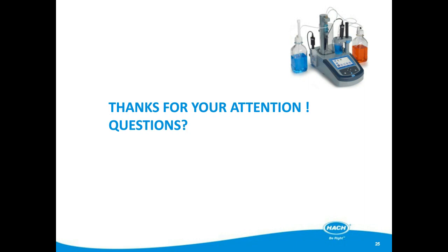Okay, I think that is clear. A final question, and I think it is the last one. I can't see other ones, but if you have one, you can drop it in the Q&A button. The question is, Philippe, do you stir the sample during the titration, and how?